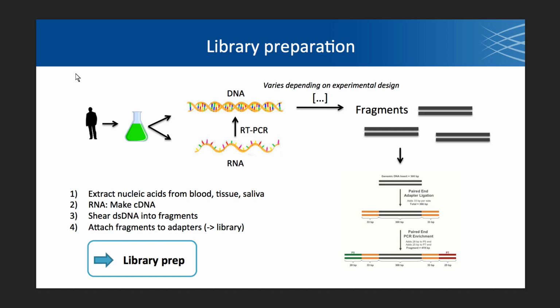So that's library preparation. Looks like there's very few steps here, but it's actually quite a complicated issue, and you have to perfect that in order to reach very little bias, because this is DNA, so things like GC bias and the length make it so that if you don't do it carefully, you only get coverage in parts of the genome and not other parts.